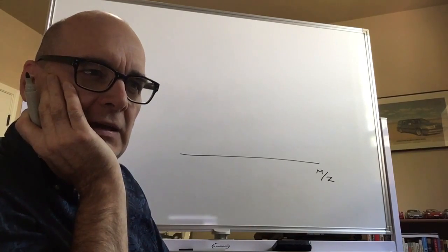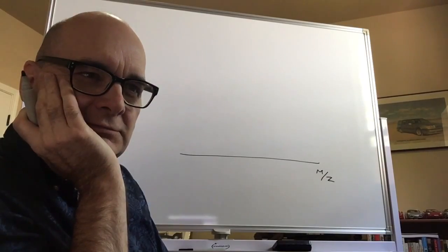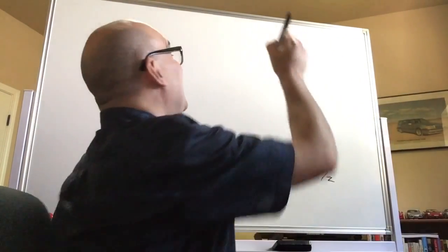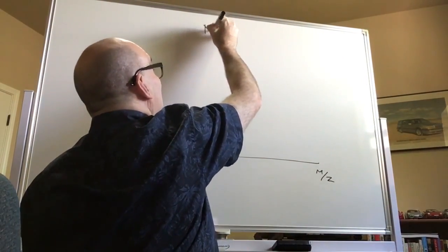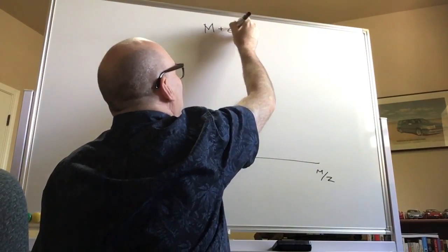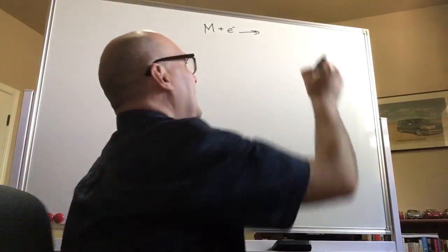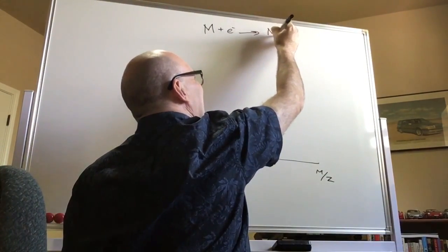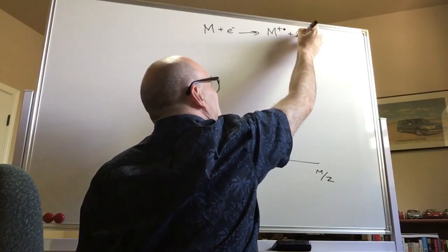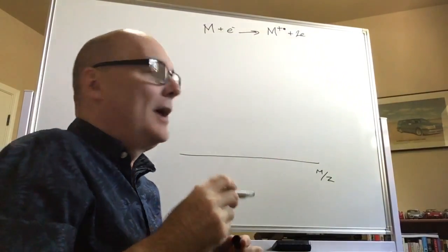The +1. It's +1 because I'm going to take my molecule, and I'm going to bombard it with electrons, and I'm going to convert it into a radical cation.